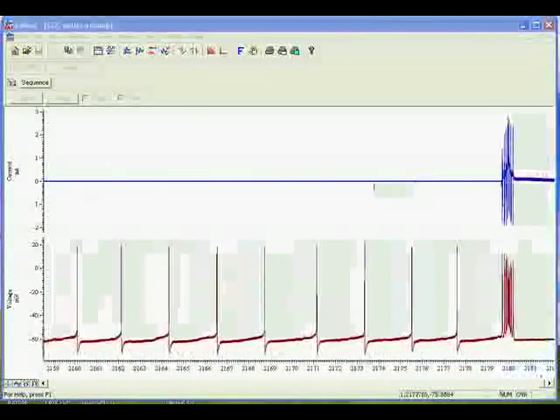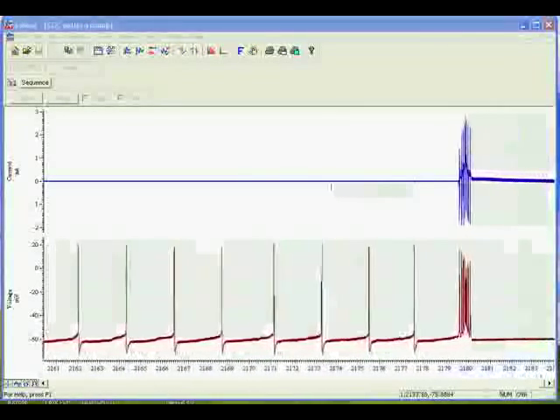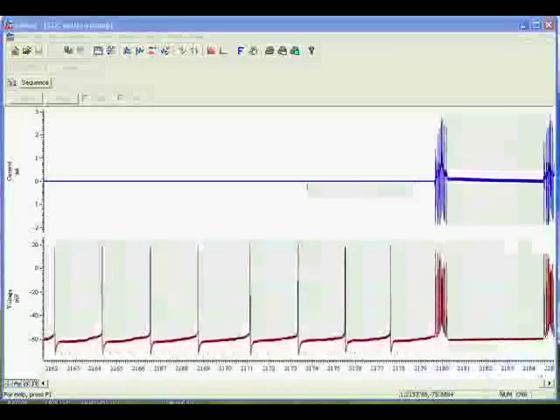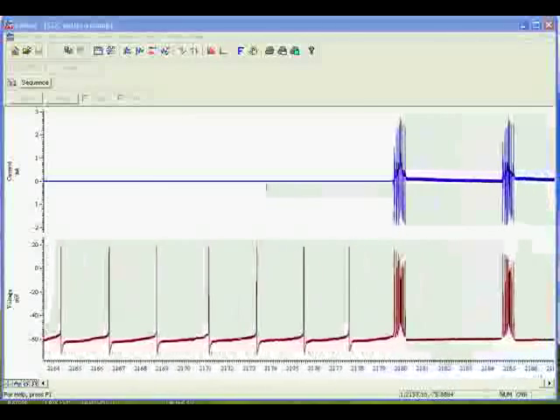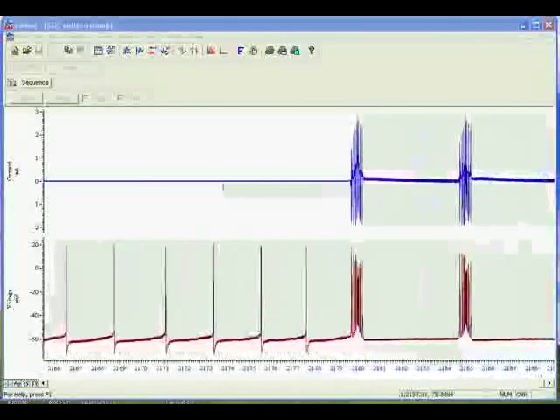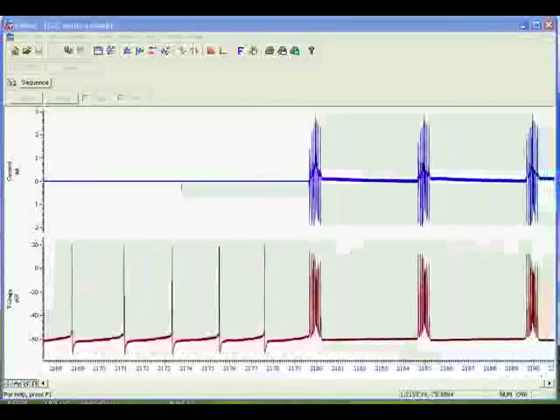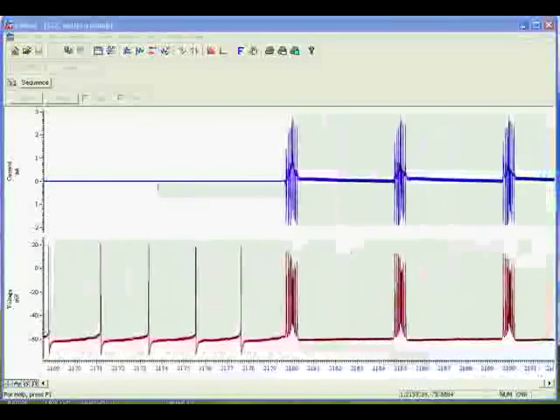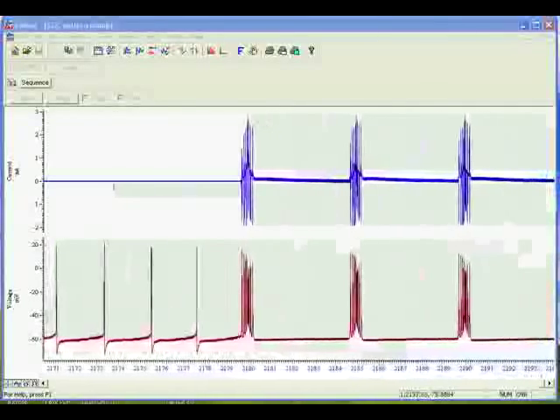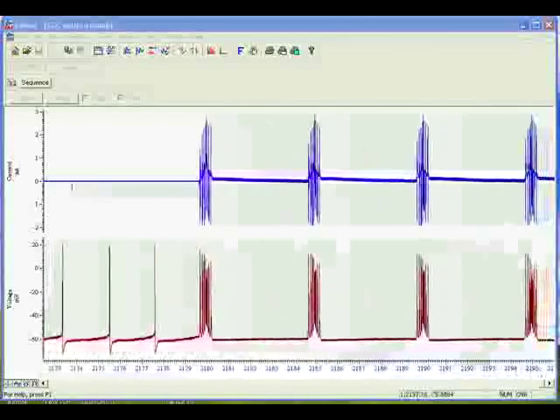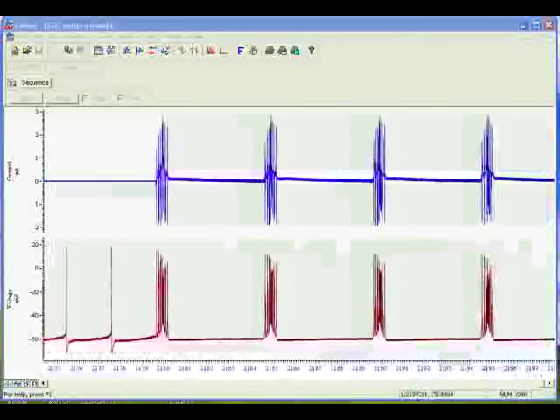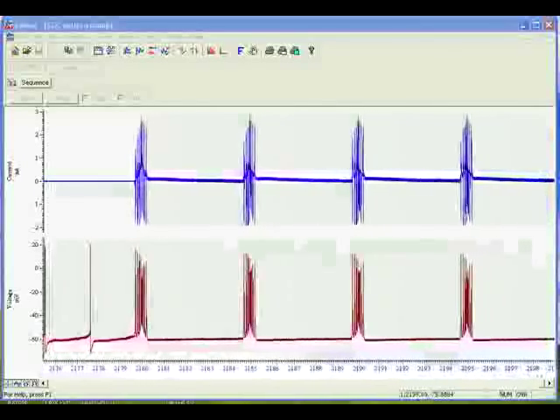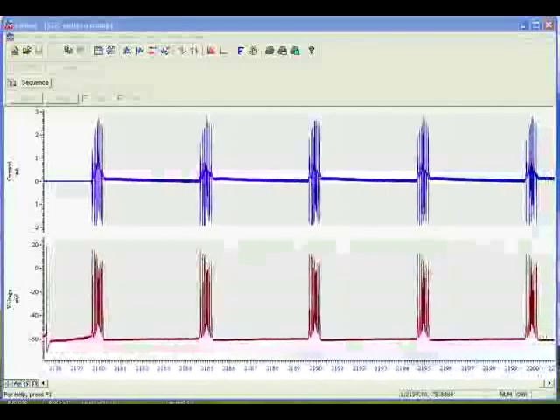The cell would never usually fire at such a rate, and as you can see we are able to elicit around 8 spikes. The top trace shows the current injected, which is between minus 2 to 3 nA. You can also see that between bursts there are no spikes generated, they are actively suppressed by the system.